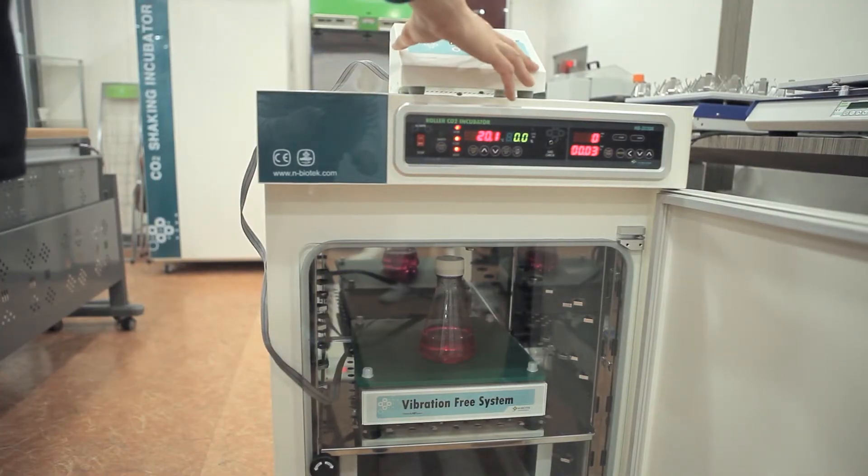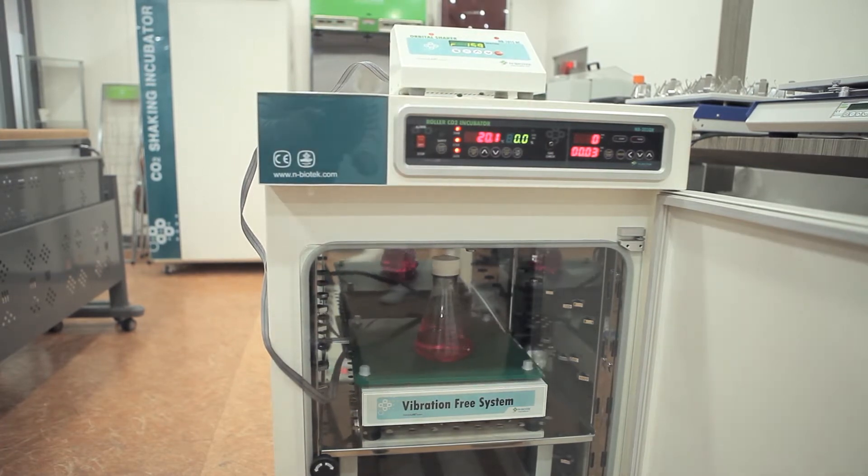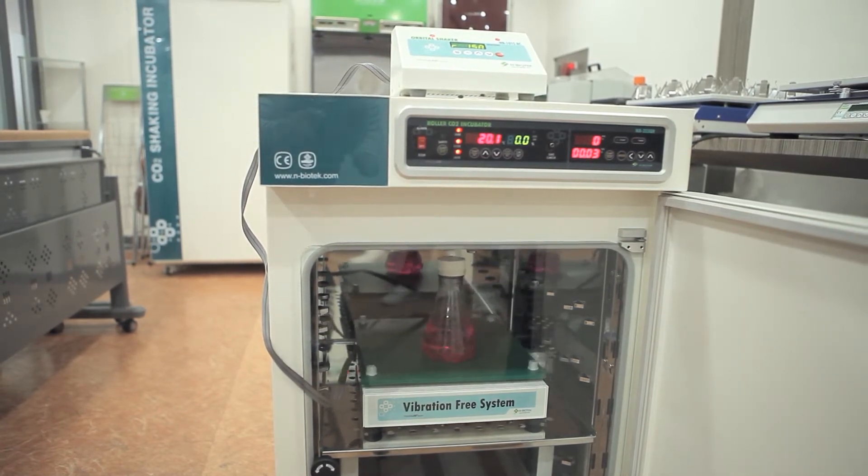So now you can use the shaker without opening the incubator, preventing any contamination that might occur while opening and closing the door.